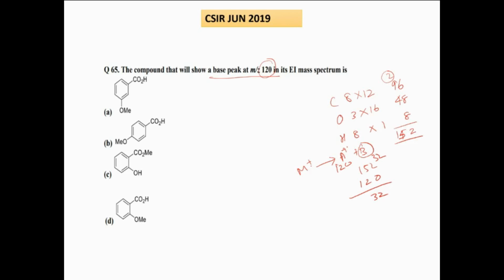So நீங்க molecule உடைச்சு பார்க்கணும். Suppose இங்க ஒரு CH3, இது OMe போச்சுனா, OMe னா எவ்வளவு இருக்கும்? So 15 plus 16, 31. So இது வாய்ப்பு இல்ல. 32 na generally methanol. So methanol எப்படி வெளியே போகும்? So there comes the molecule. So நம்மளுக்கு we have to go for a slight rearrangement.